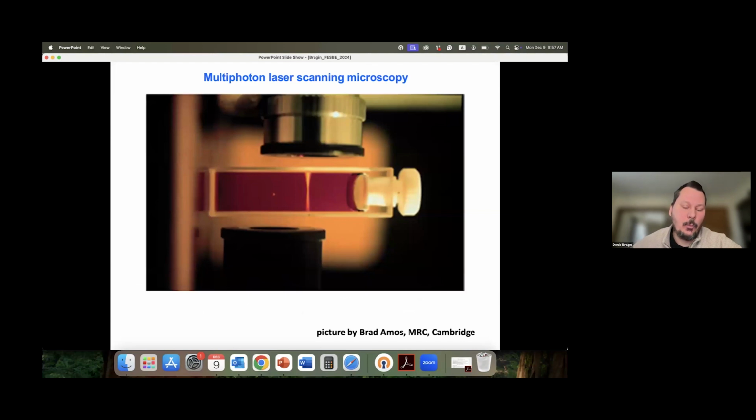As you see here, this is multiphoton fluorescence at one point of focus, and there is standard single photon fluorescence, where you can see fluorescence across the whole specimen, which gives a very noisy background and also adds to phototoxicity.